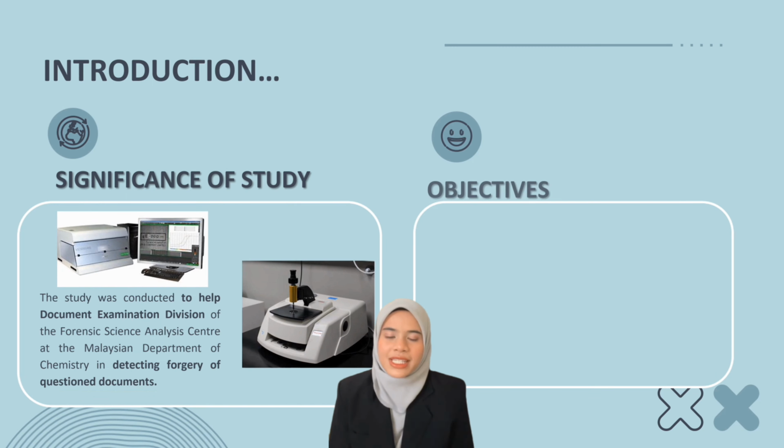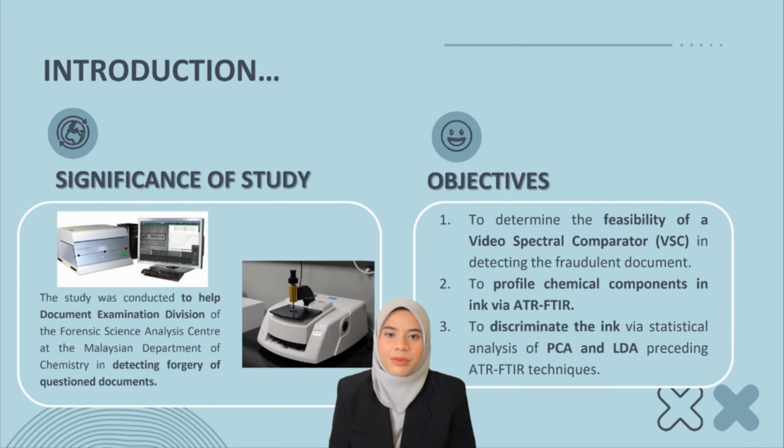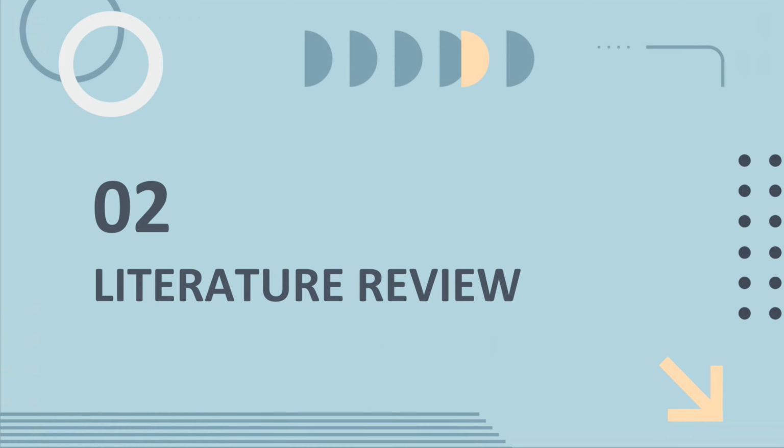The objectives of this study are, first, to determine the feasibility of VSC in detecting fraudulent documents, second, to profile chemical components in inks using FTIR, and lastly, to discriminate the ink via statistical analysis of PCA and LDA.